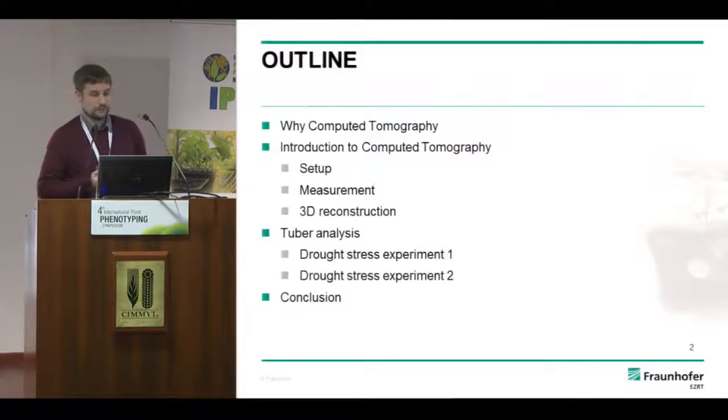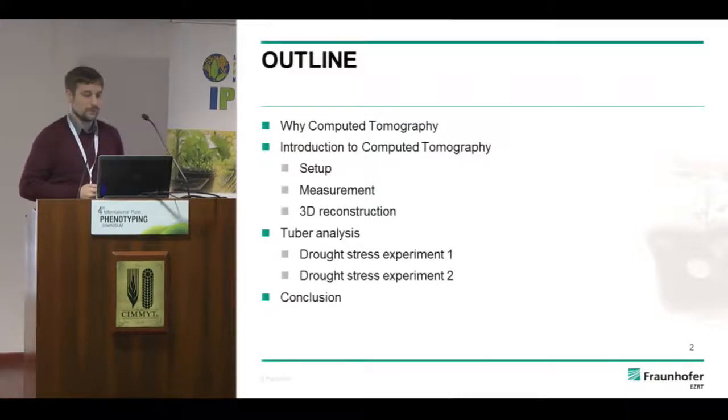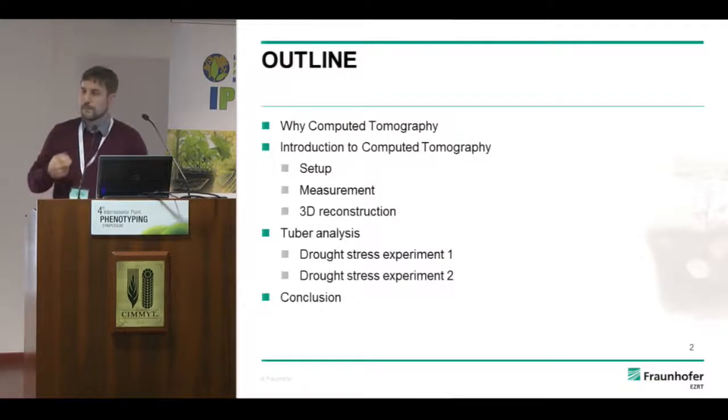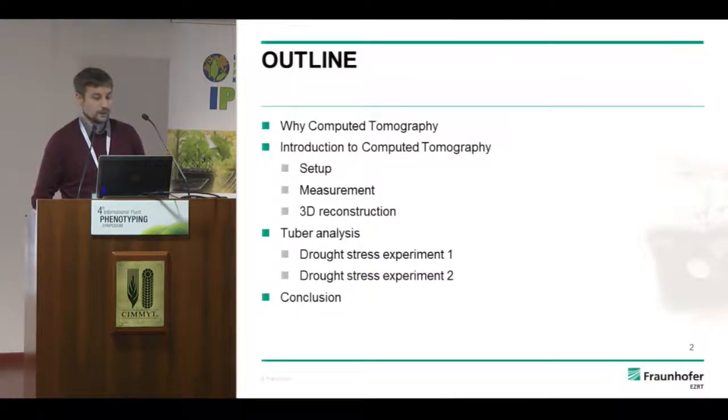So first, why computed tomography? It was already introduced very well. What is the benefit of computed tomography? Then I would shortly show how the setups look like in our system, how measurement is typically conducted, and what this 3D reconstruction tells you physically about your data set. And afterwards I will show the drought experiments we did and a short conclusion.